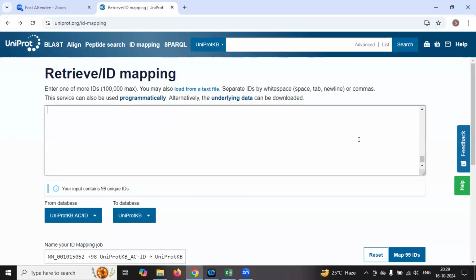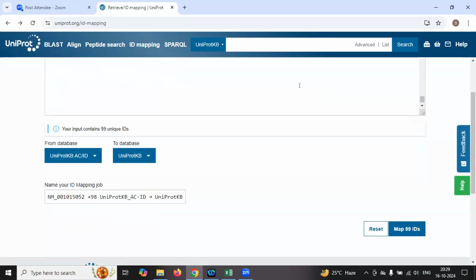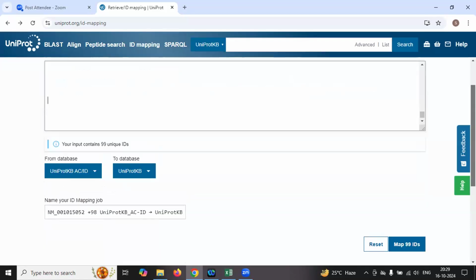Yes, Shubham. Scroll up, it is already pasted, I guess. Not from here, ma'am. In the box, there is a small slider on the right hand side. Yeah, it is already pasted.